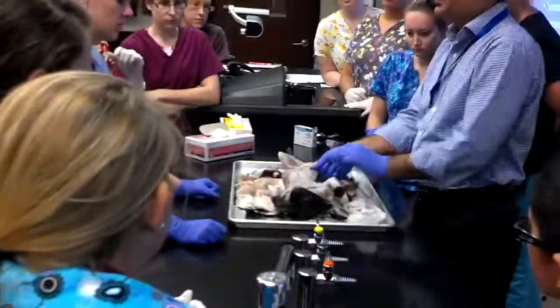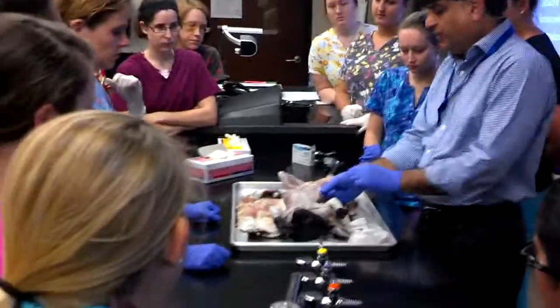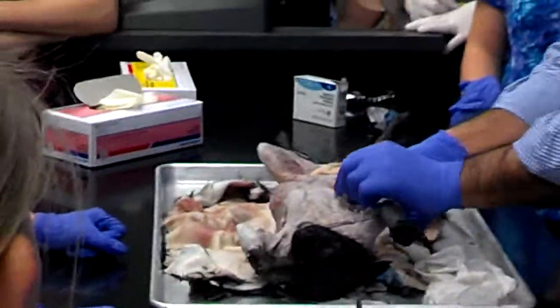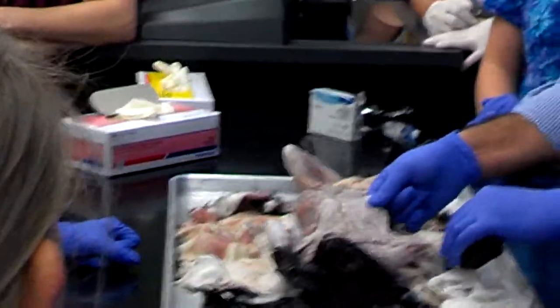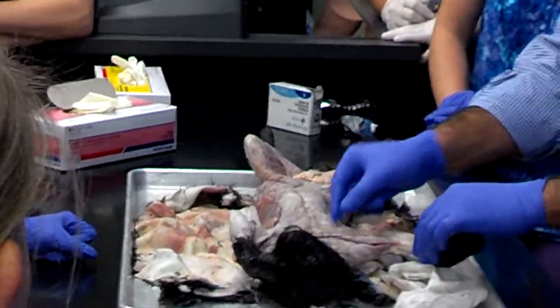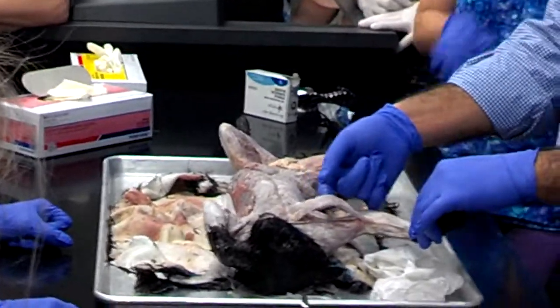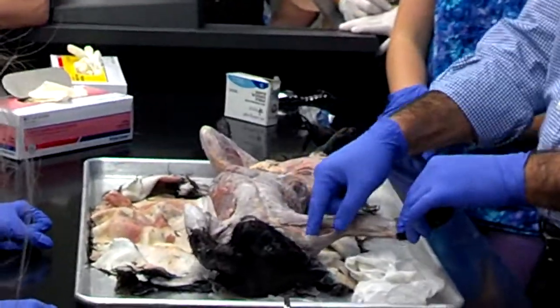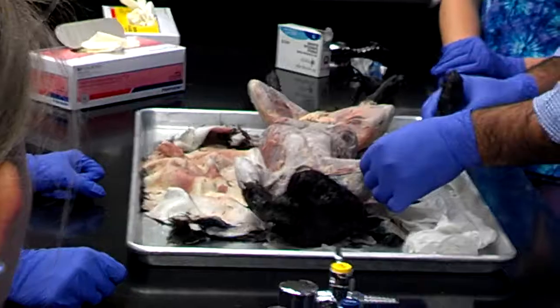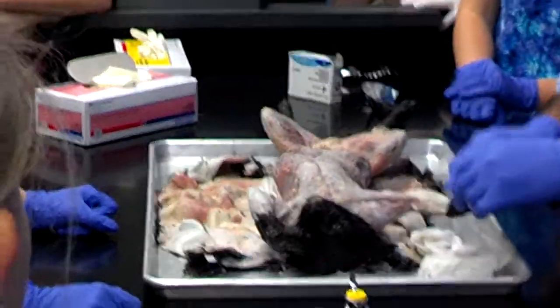This is your xiphihumeralis, part of this going way back up here. You could see this one. Then here, this is your pectoralis minor. The minor is bigger. This is major. This is pectoralis, and this is clavobrachialis or clavodeltoid. It is the same. It's the two names. Clavobrachialis.